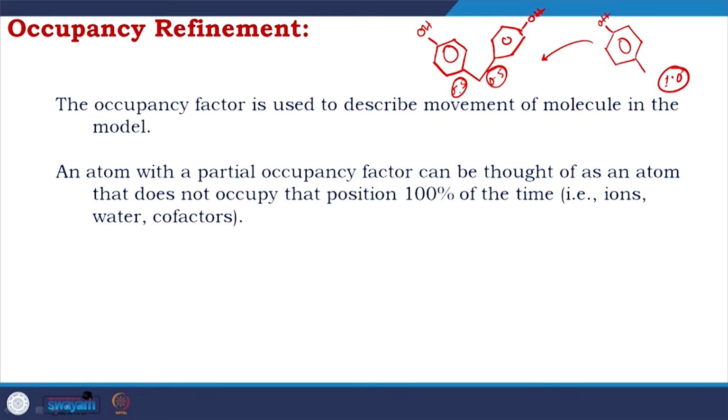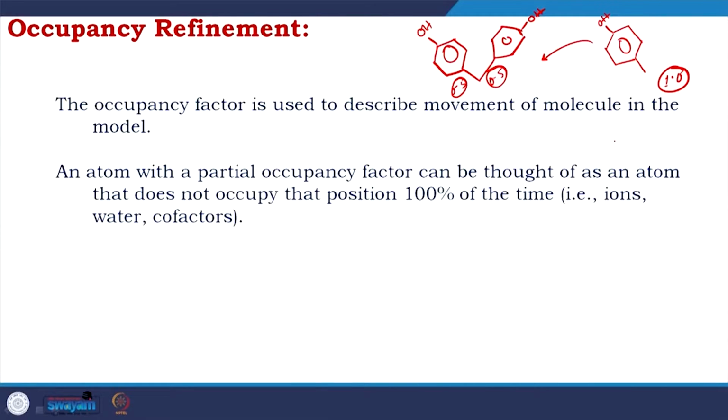Also, here I have to tell you a very interesting concept. The software has acceptance limits. So, it would consider a conformer only up to a certain level of intensity it is providing. What I mean by that? Let us say there is a tyrosine and it has 10 conformers. 5 of them would contribute, let us say, 0.01% each.